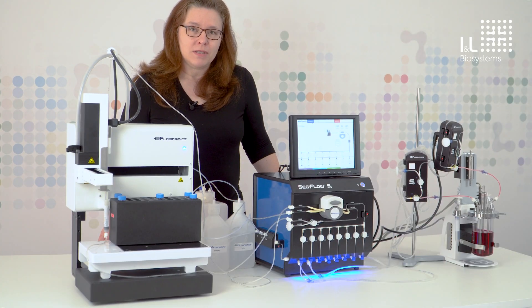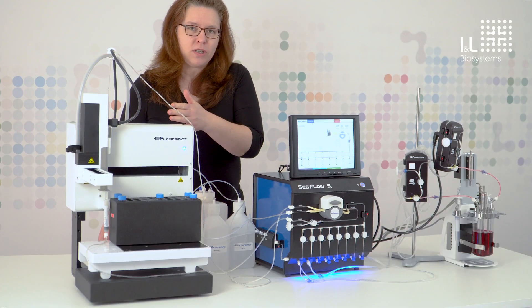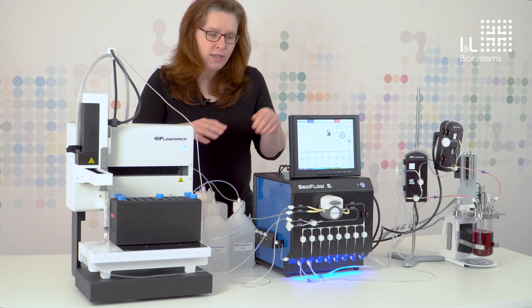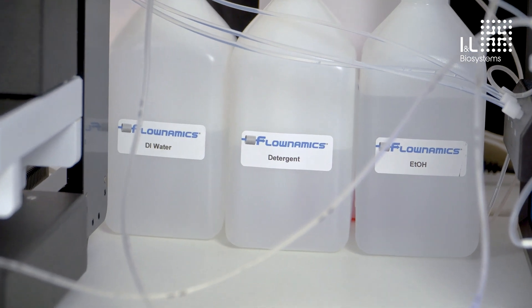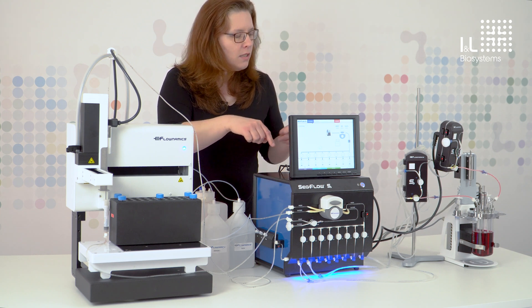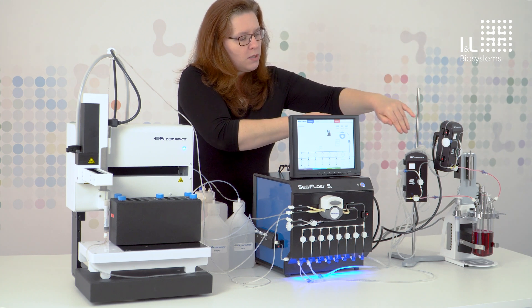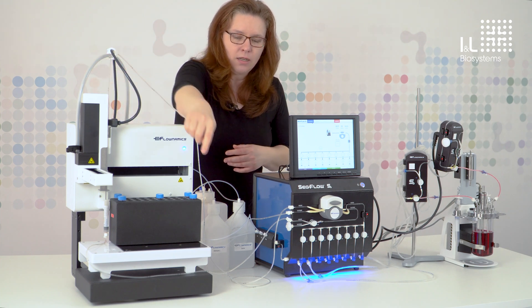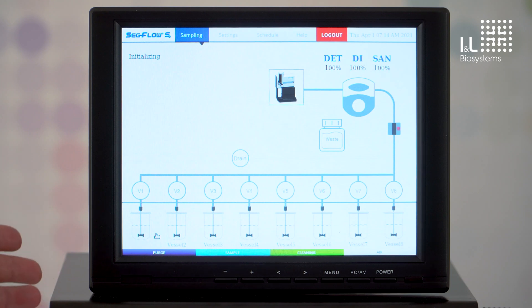The last step in sampling is the cleaning process. The entire course from the fermenter to the collection station must be cleaned. This is done with these bottles, which are located directly on the SecFlow — for example, water, detergent, and disinfection solution — which are connected here and which then flow one after the other through the entire course, making a U-turn over the sample tube back, going over this tube from the flow fraction and the needle, then via the waste tube to the waste bottle.